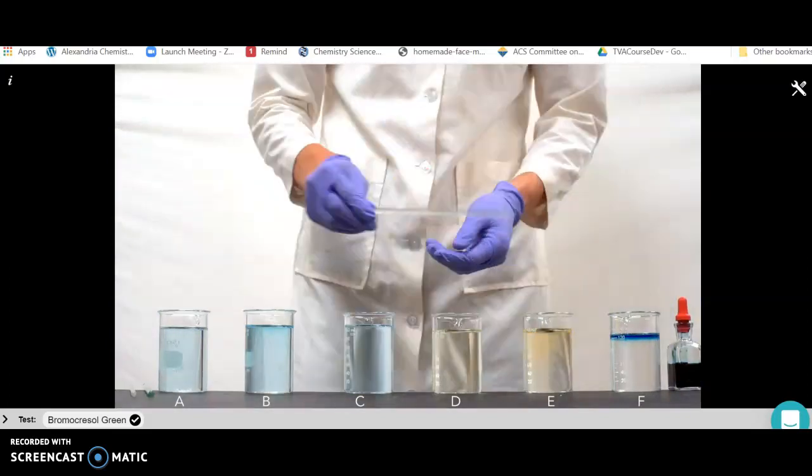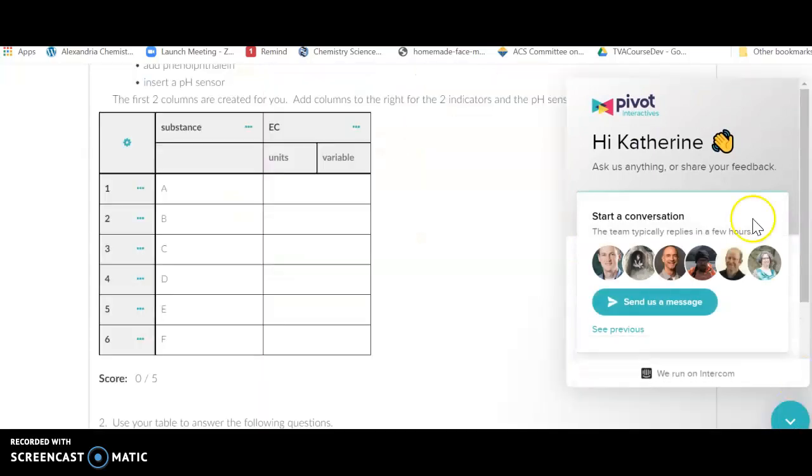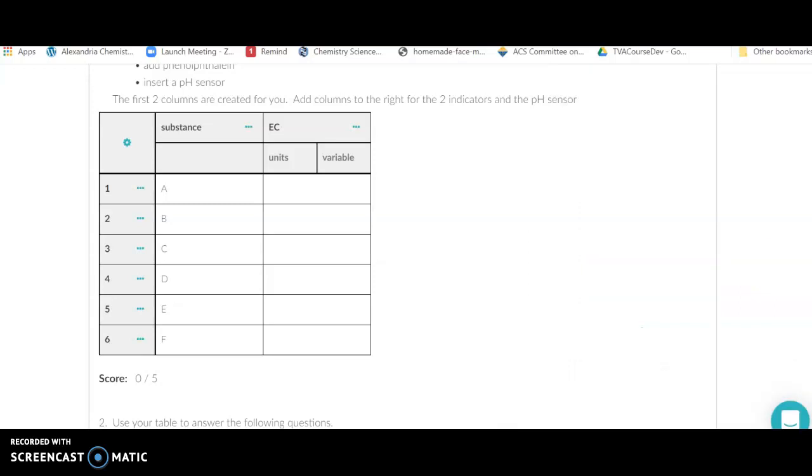You're going to record the results as you see them. For example, on this one here, we viewed the color as we added the indicator. You're going to create some columns for your substances and for what you're going to do.